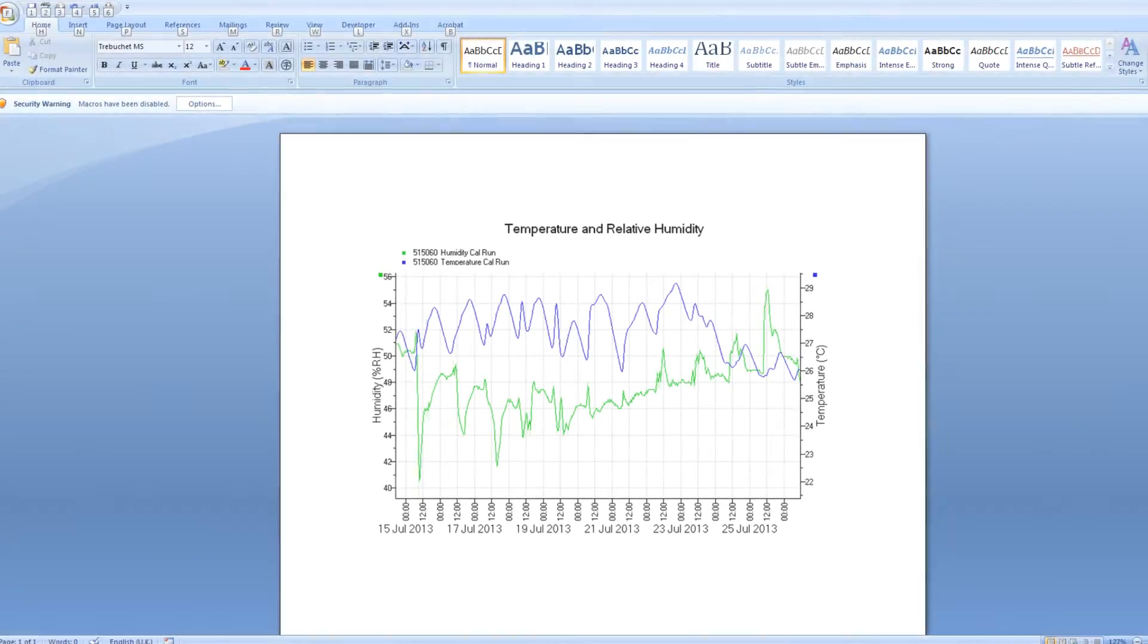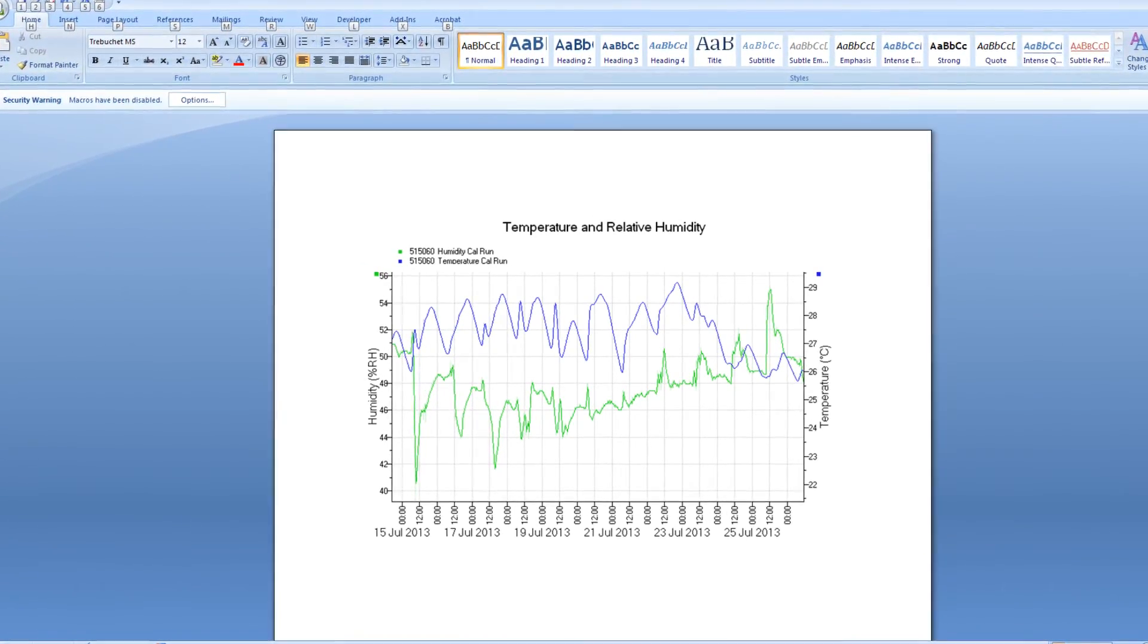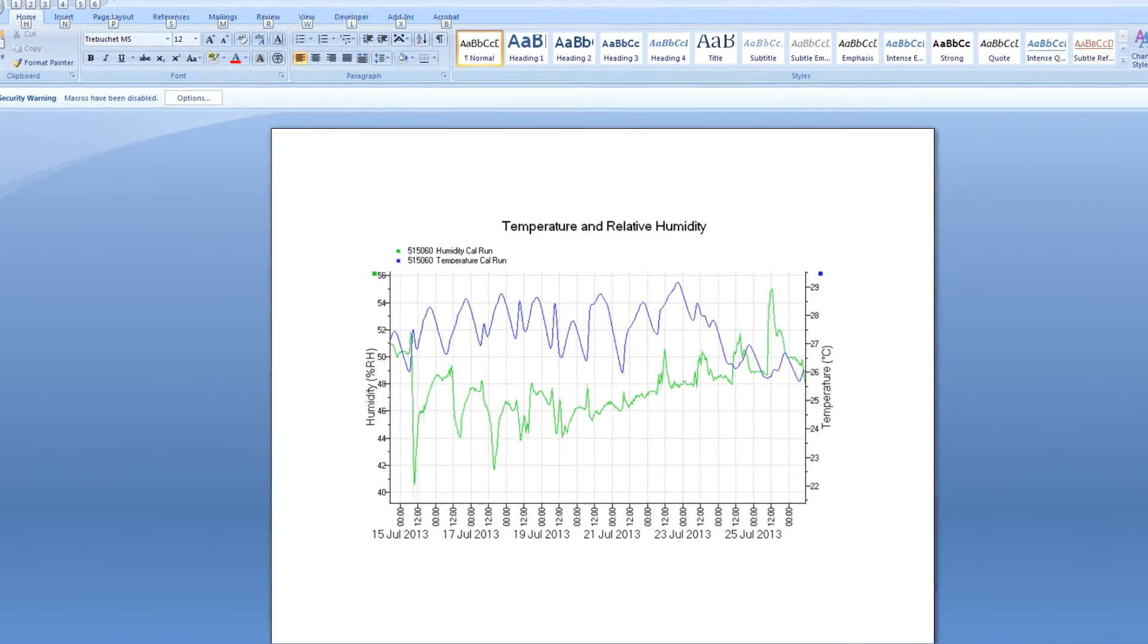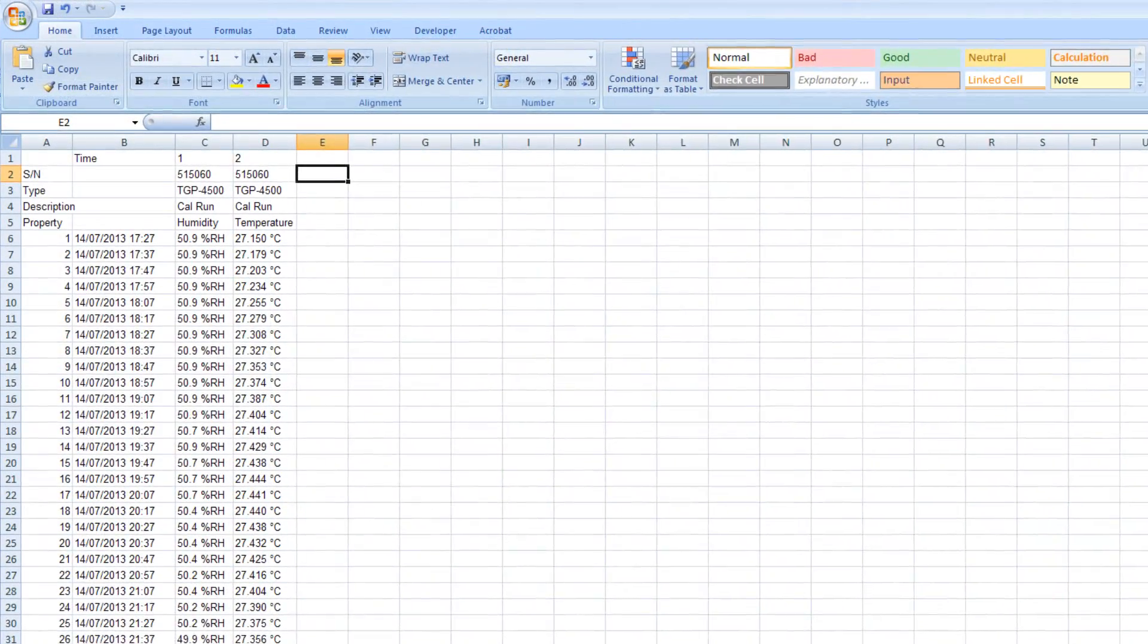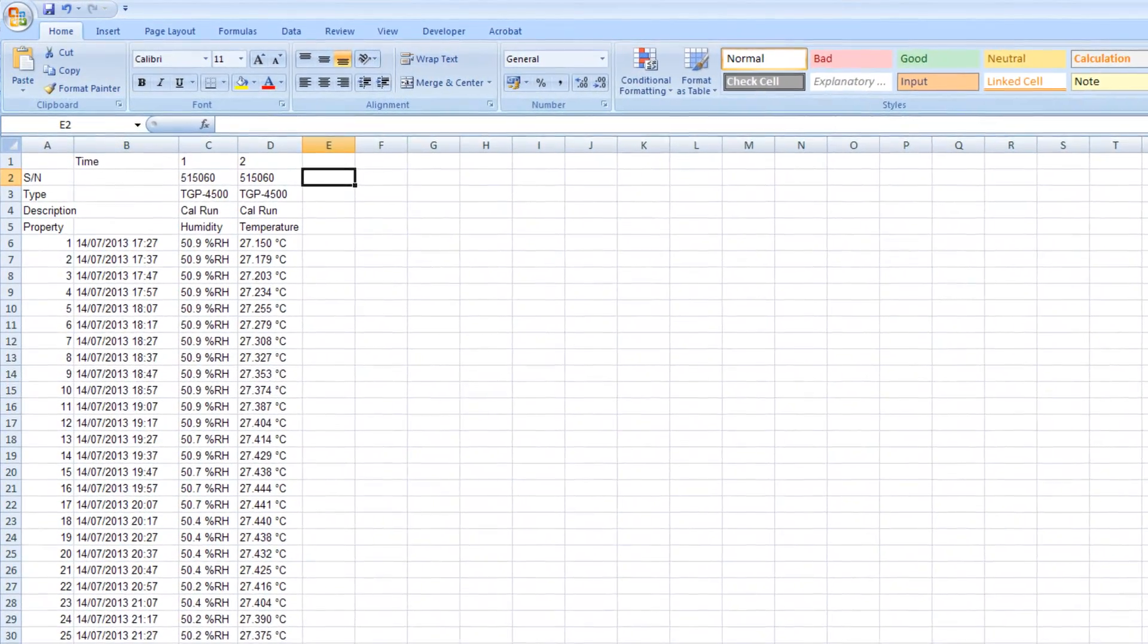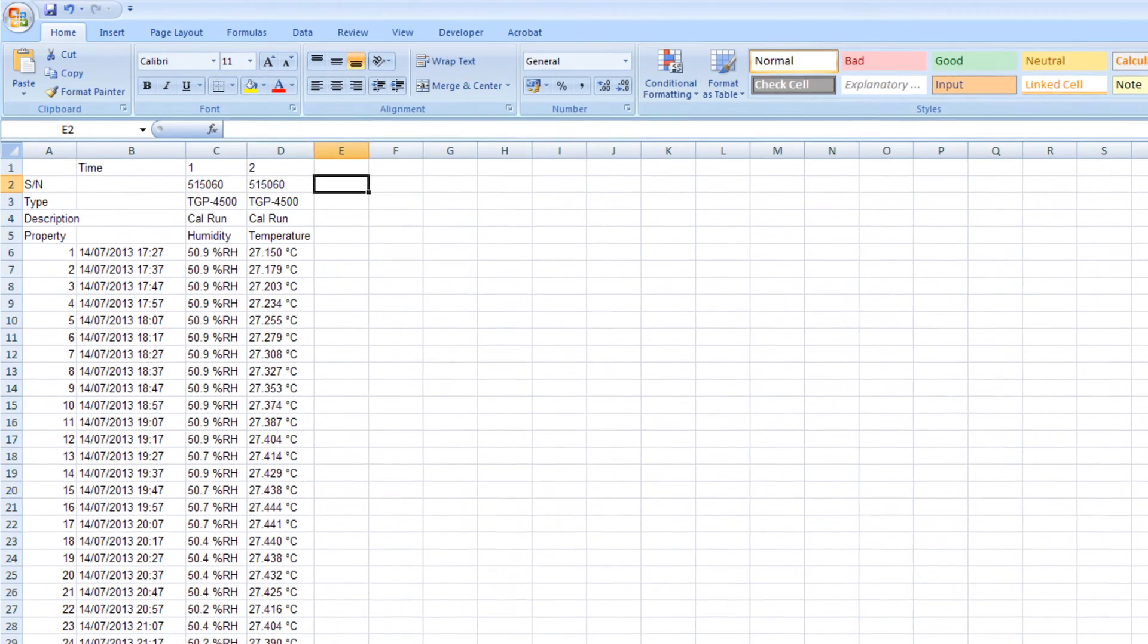Graphs can be exported as images for use in reports and the table of readings and summary views can be exported as tables for use in a spreadsheet or a third-party database.